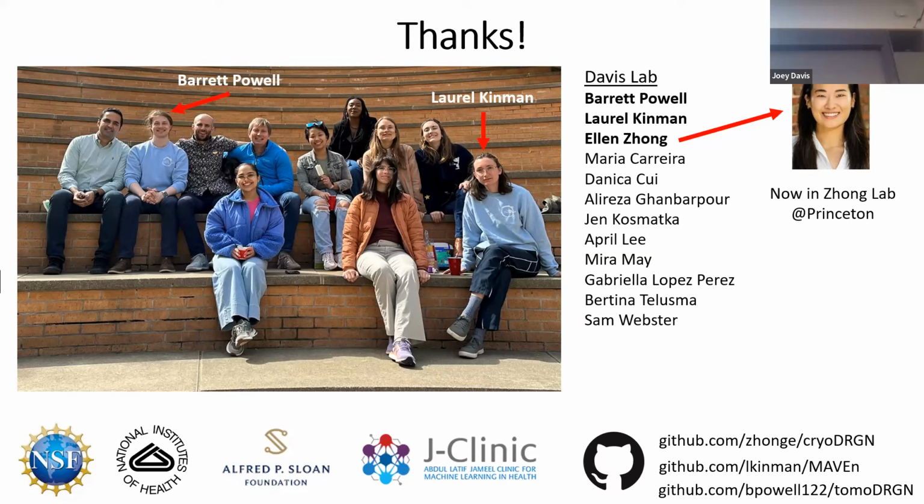And I think what that's telling you is that the genetically encoded heterogeneity of these one base pair extensions is relatively small compared to all the rest of the imaging. Right, there are other signals there. It's not that the algorithms are wrong. They're right in that they are classifying some feature of the image, but it's not the feature that we care about. And so you can do things like put a mask if you know where the changes are, and then the algorithms do much better. So we think that the underlying data set is correct. But yeah, the out-of-the-box tools are worrisome when you look at the results.